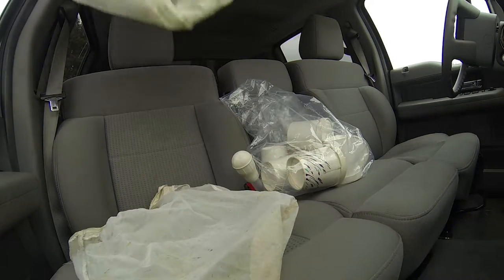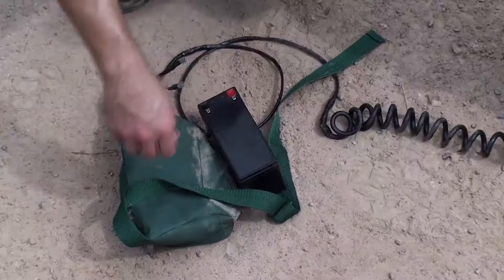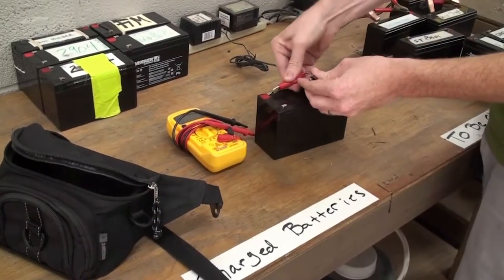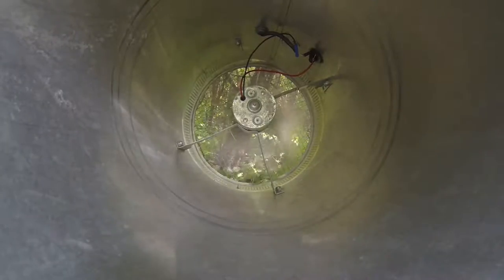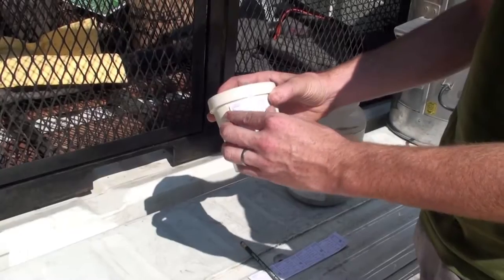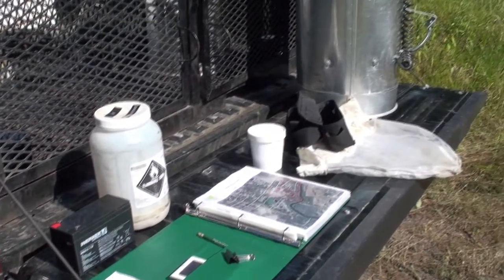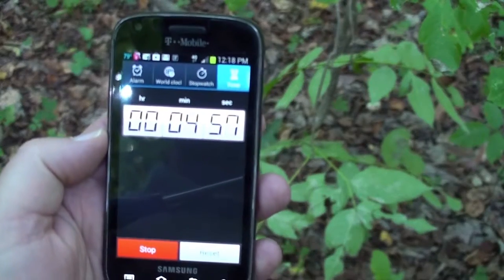You should carry two nets for the Succ-O-Matic. You'll need a kill jar that is sufficiently charged with ethyl acetate and fully charged 12-volt batteries — it's a good idea to have two batteries. A fully charged battery has enough power to collect up to a dozen samples, but as a battery gets older, its life shortens. Listen for a change in fan speed to determine when to switch batteries. You will also need sample containers, labels for adult mosquito samples, maps for the sites you plan to sample, and something to keep track of sampling time — a watch, a cell phone with a timer, or a stopwatch will do the trick.